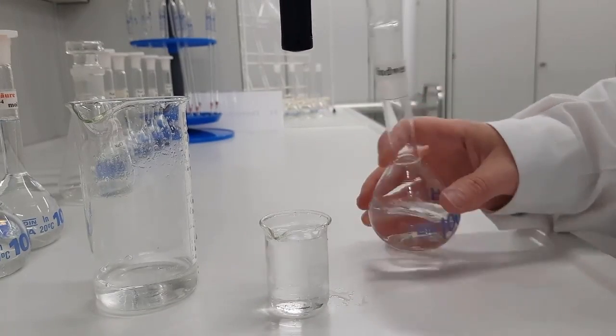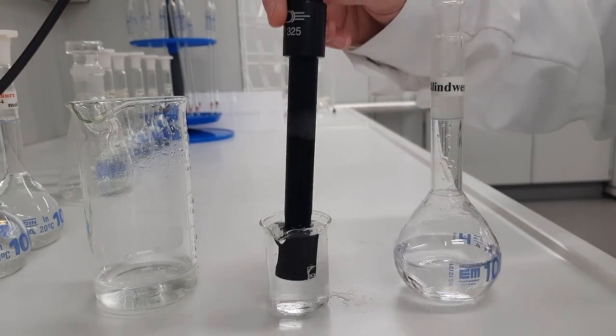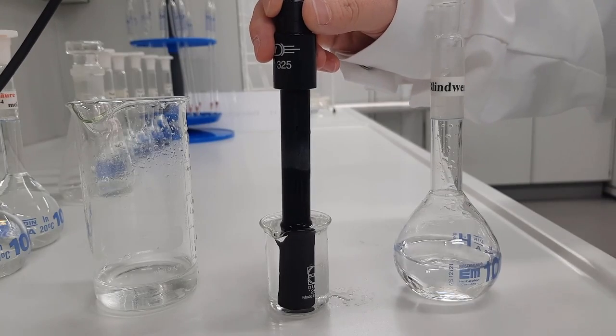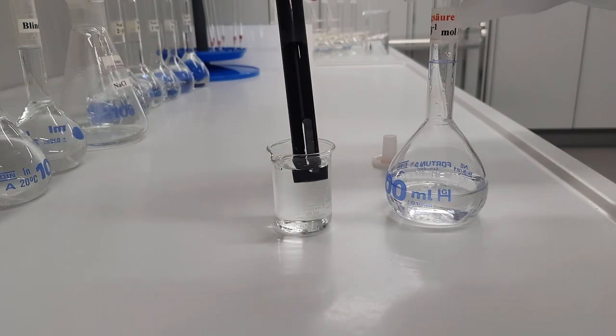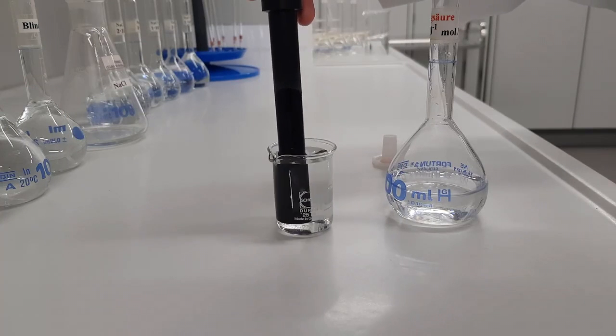When changing from acetic acid to sodium chloride, rinse the electrode repeatedly with distilled water until the conductometer indicates the original conductivity of the blank sample.